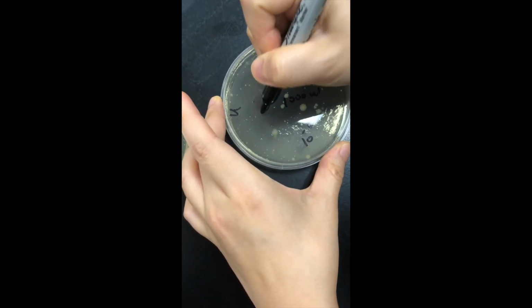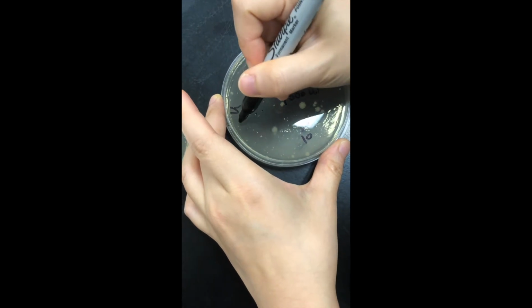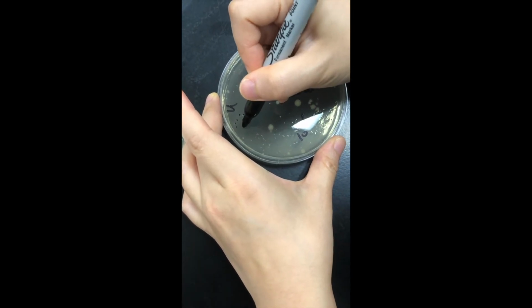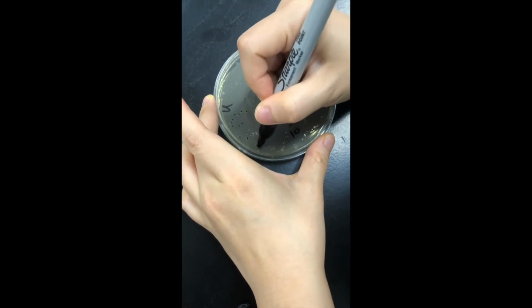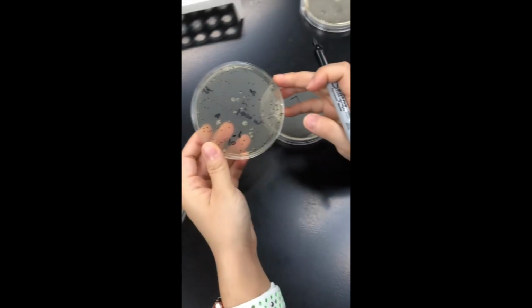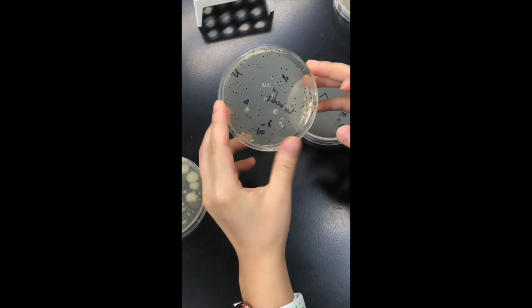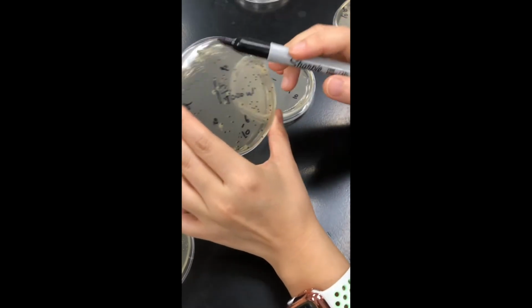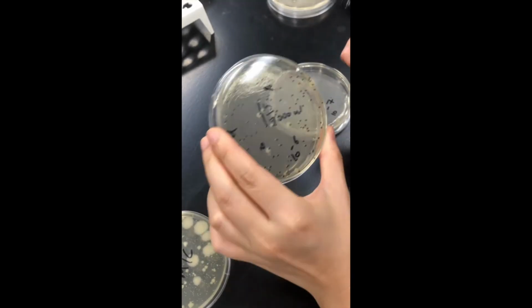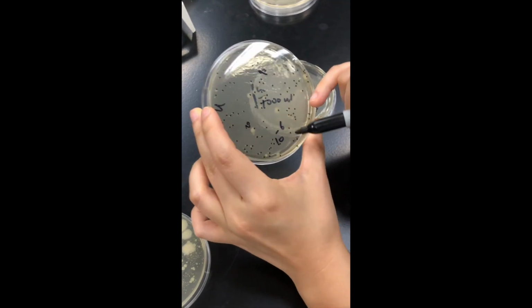1, 2, 3, 4, 5, 6, 7, 8, 9, 10, 12, 13, 15, 16, 17, 18. So dear students, we finish counting the CFU per ml. The total number is 112 colony forming units present on this 10 to the minus 6 plate.